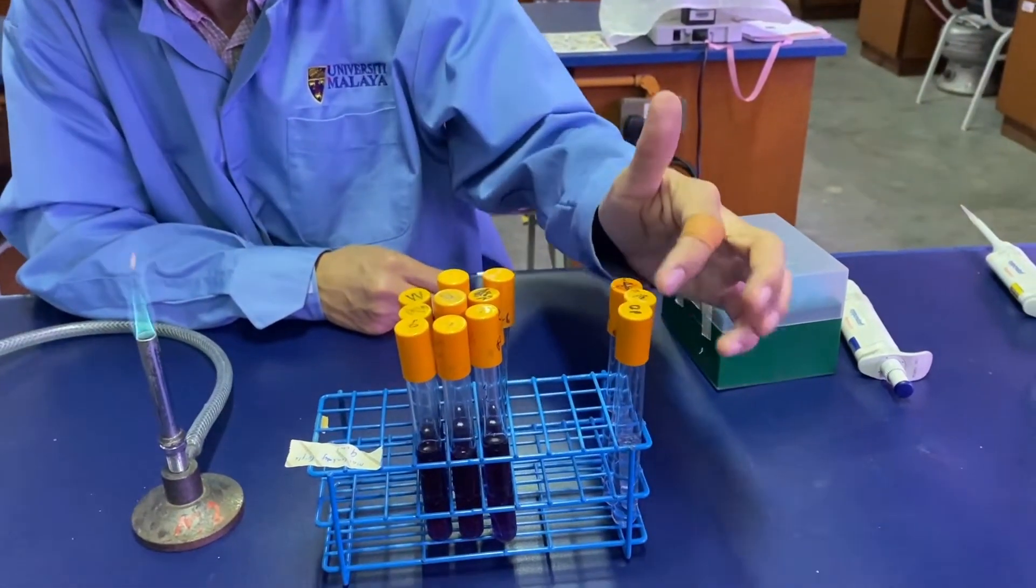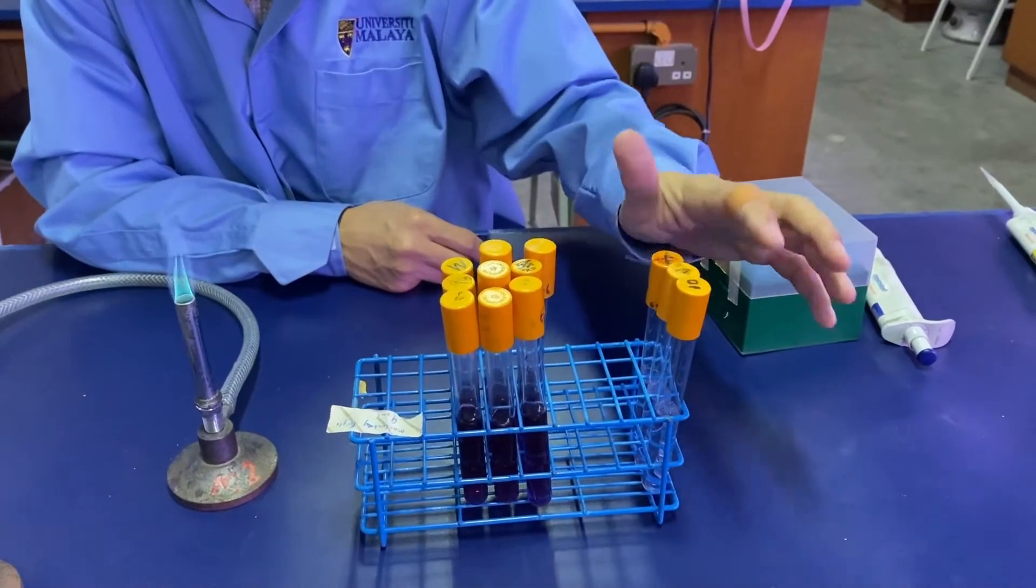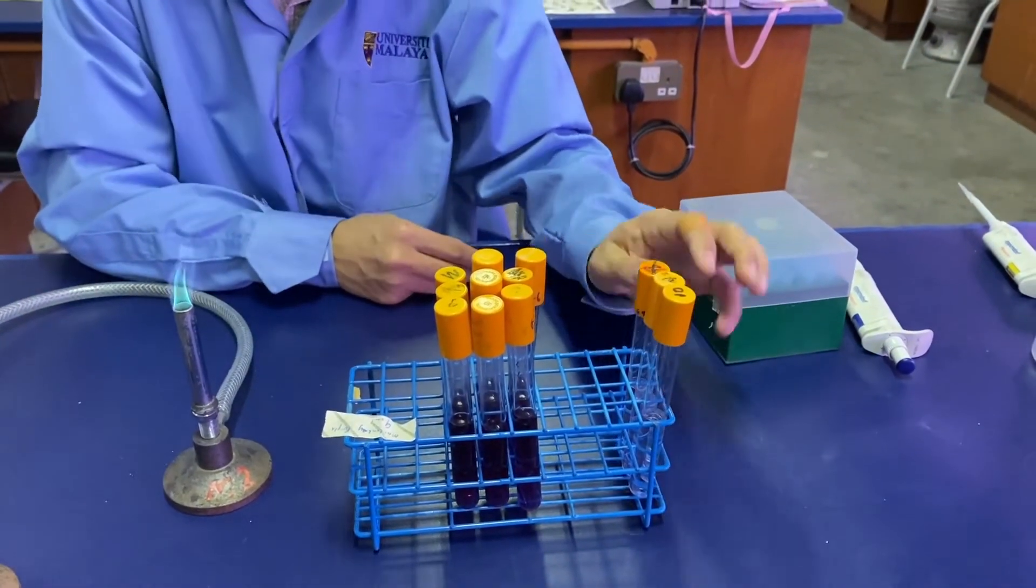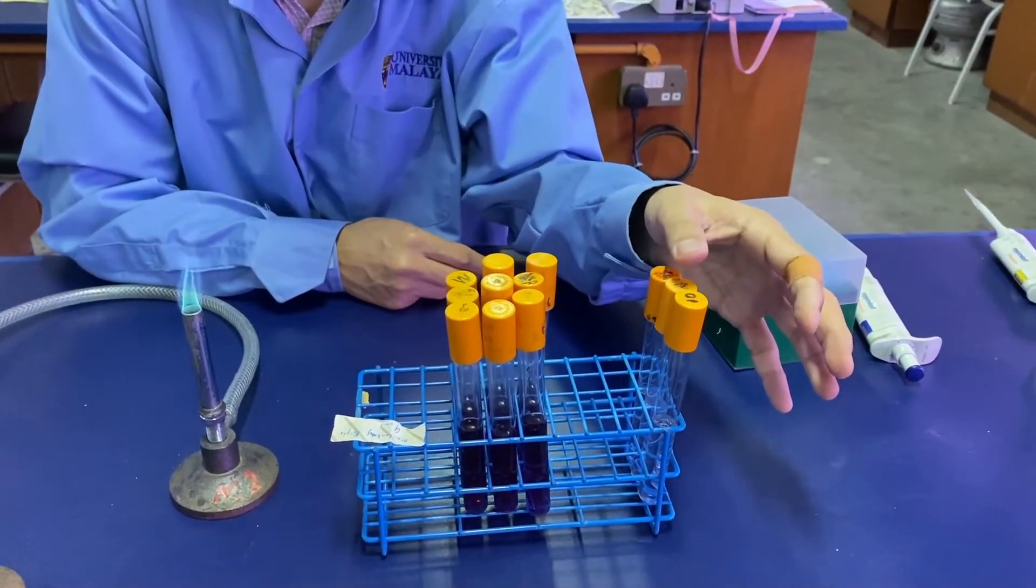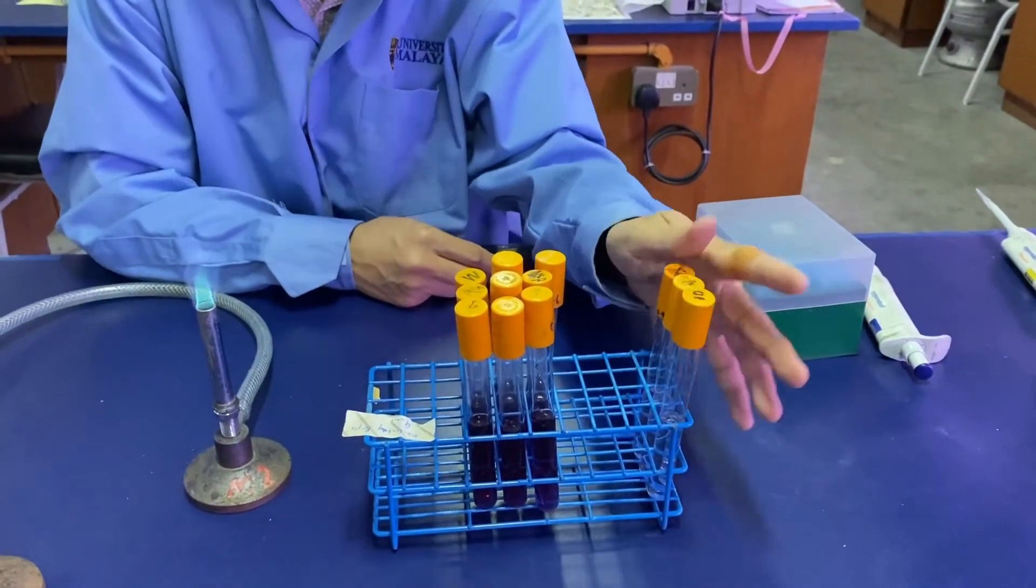For the sample, we'll be carrying out serial dilution to three orders: minus one, minus two, and minus three.